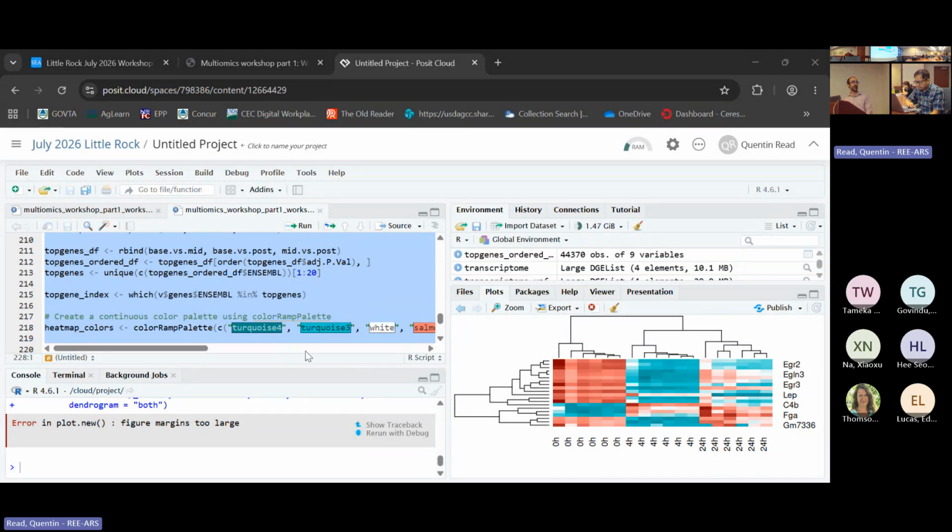And what this shows is, let's see, red means higher expression and blue means lower. It turns out there are quite a few genes. These are their names from the annotation that we have. These are genes that were low expressed at time 0 and then go up a lot at time 4, and some of them are still highly expressed at 24. And there are also a few genes that were highly expressed at time 0 and then go down.